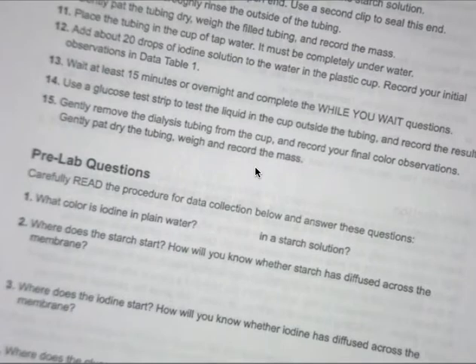Number 3, where does the iodine start? So where did you originally put iodine? How will you know whether iodine has diffused across the membrane? Once again, where is starch located initially? What happens when you combine starch and iodine?